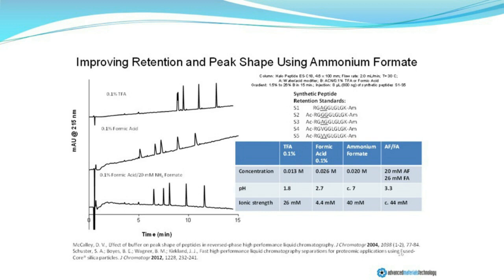So we've increased the ionic strength of the mobile phase conditions, and this has resulted in an increase in both retention as well as improvement of peak shape, that is peak width, as well as tailing. So a simple fix for this problem, and I would argue if you view the table, the most obvious correlate for this would be the ionic strength of the mobile phase.